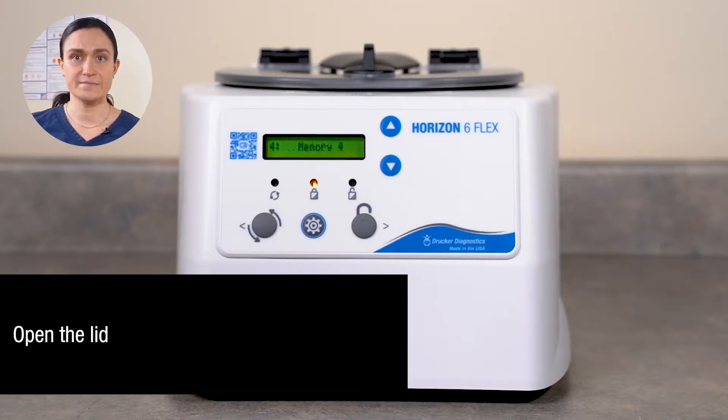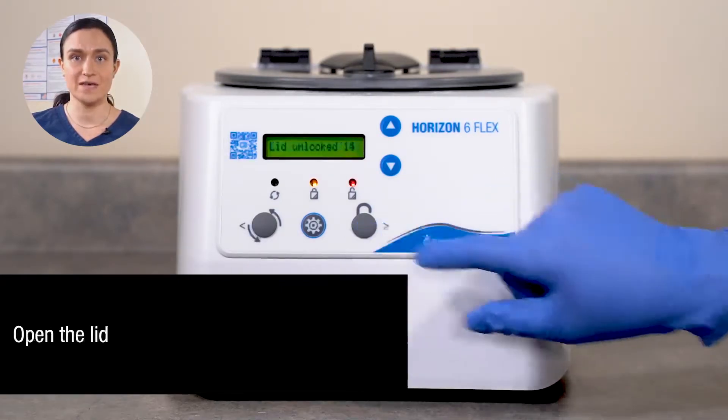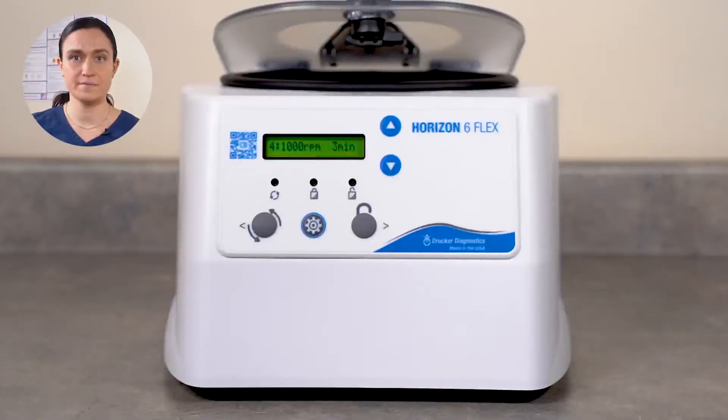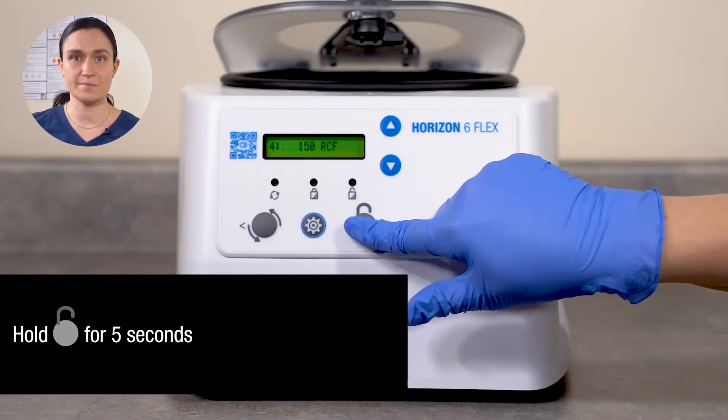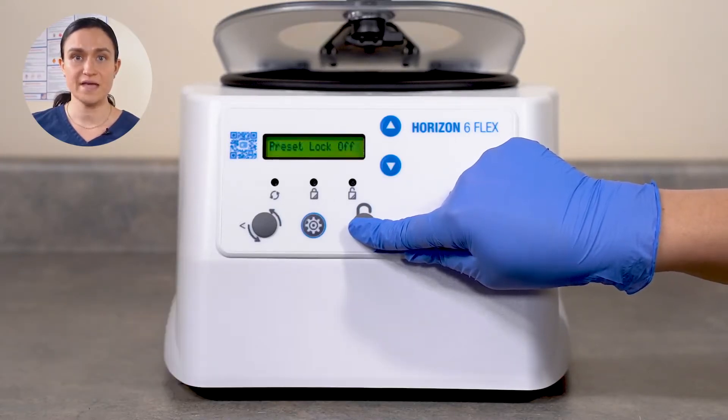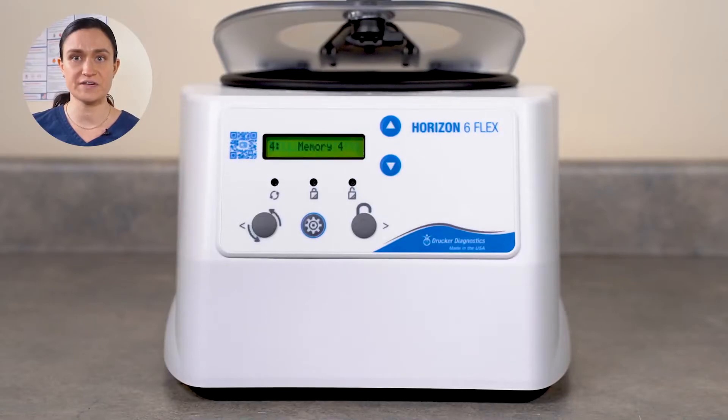Start by opening the lid. You may need to press Stop Unlock to unlock your centrifuge first. With the lid open, press and hold the Stop Unlock button for 5 seconds. You will hear a beep and see the words Preset Lock Off on your screen.